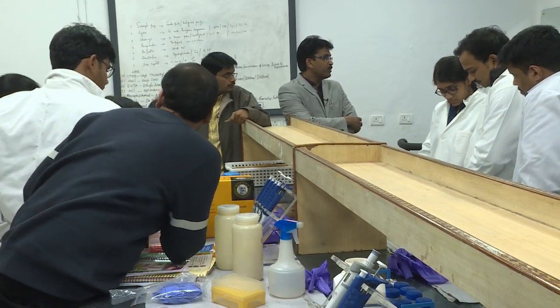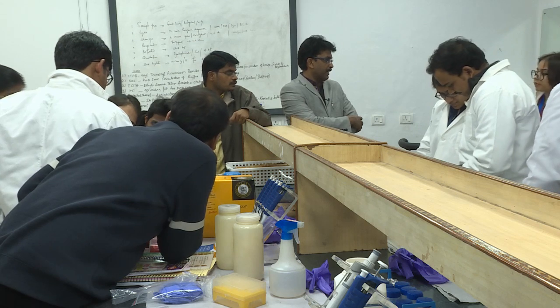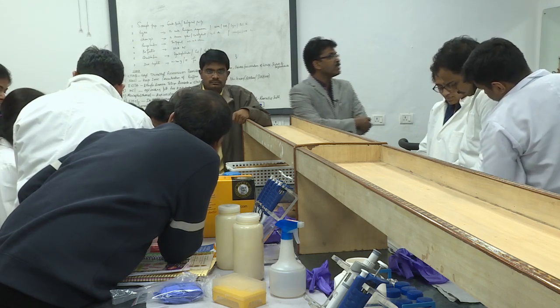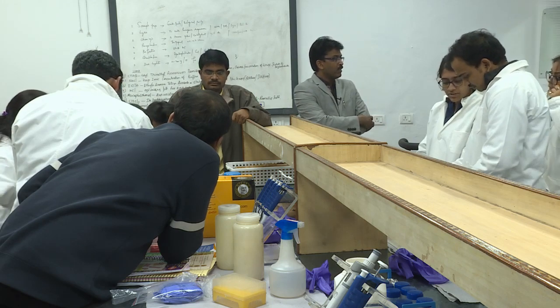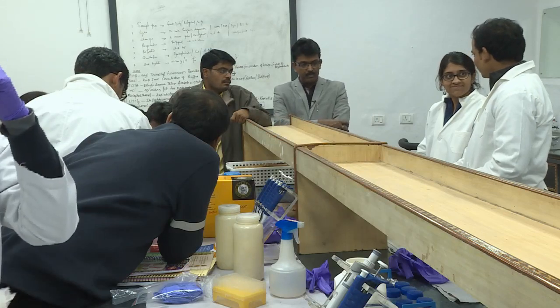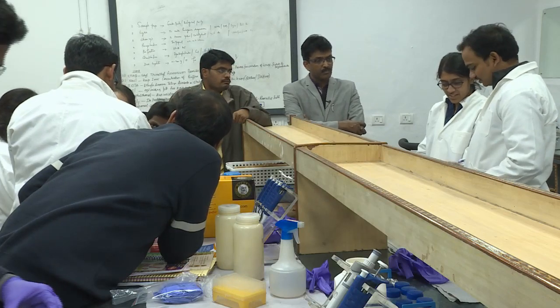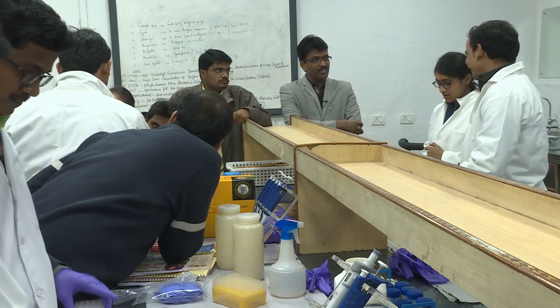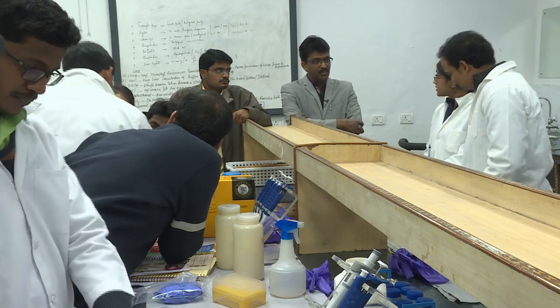So Bacillus group is going to amplify 16S ribosomal DNA. Yeah, start arranging the DNA and all the reagents. Done? Lot of RNA. You didn't add.